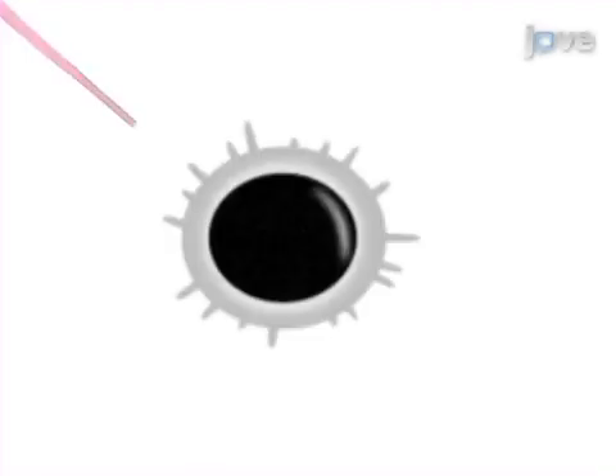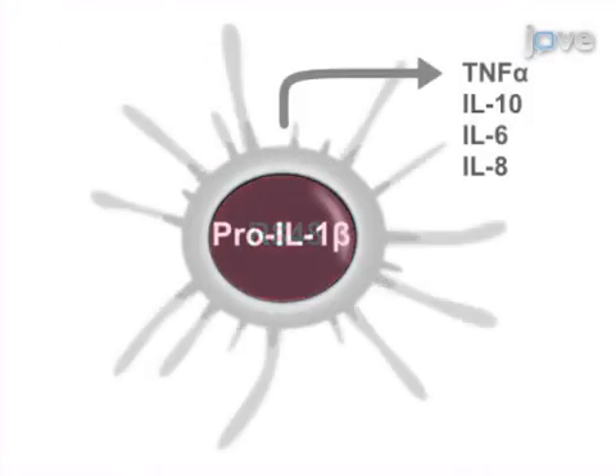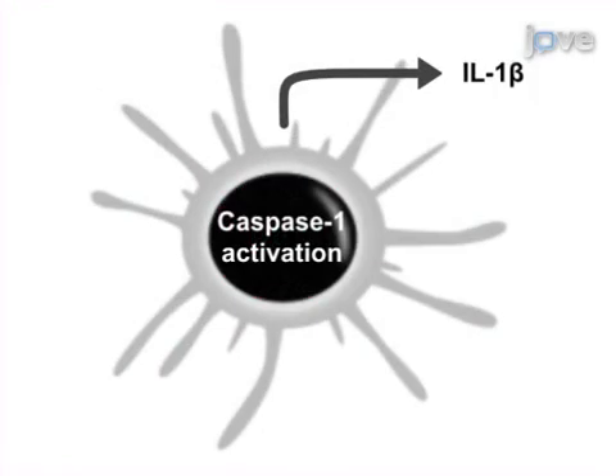First, add R848 to the cells to induce intracellular pro-IL-1-beta expression. Then, add nigiracin to activate NLRP3 inflammasome formation, which in turn triggers the cleavage of pro-IL-1-beta into mature IL-1-beta before secretion.